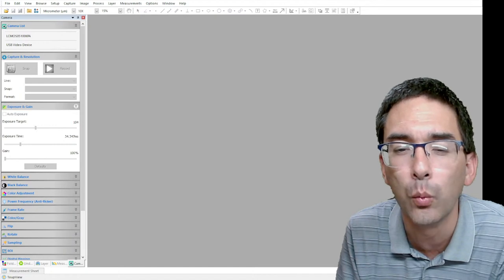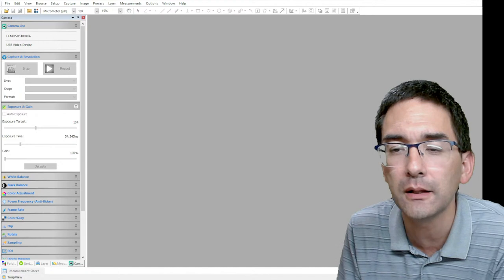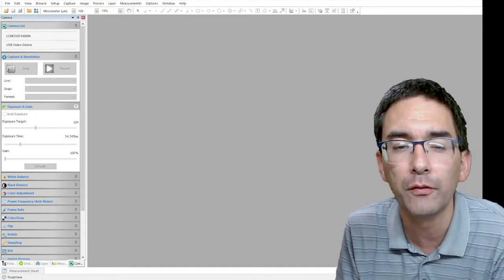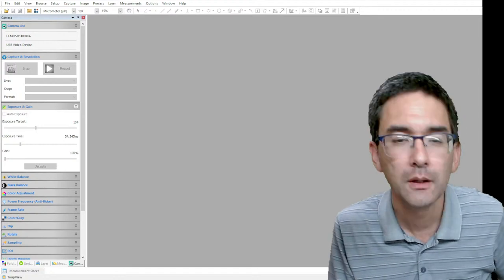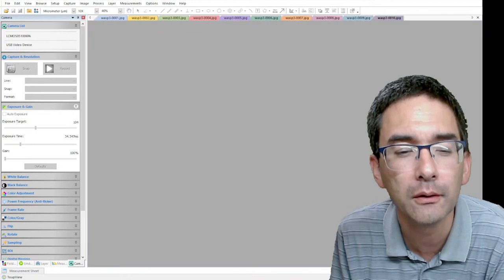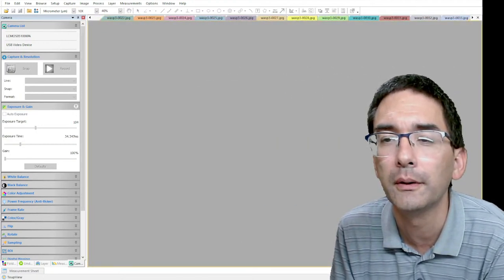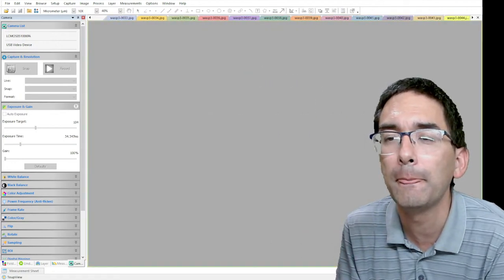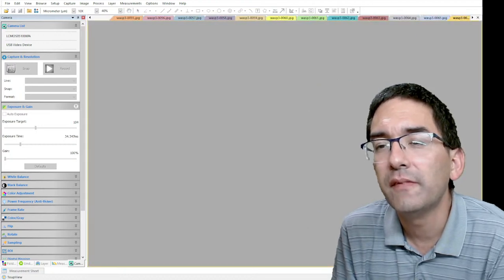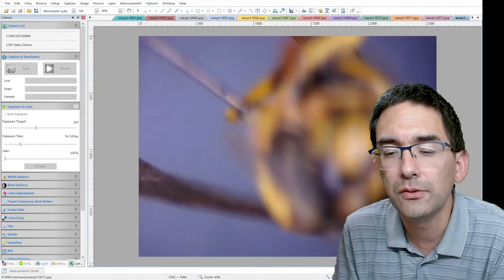And I'm going to now open over here live. Okay, some time ago, I've taken pictures of a wasp with my stereo microscope, and I'm going to simply import all of them. I don't even know how many are there. 73 of them. Yeah, it's opening all of them. That's maybe a little bit of a disadvantage of this program, that you have to open them.